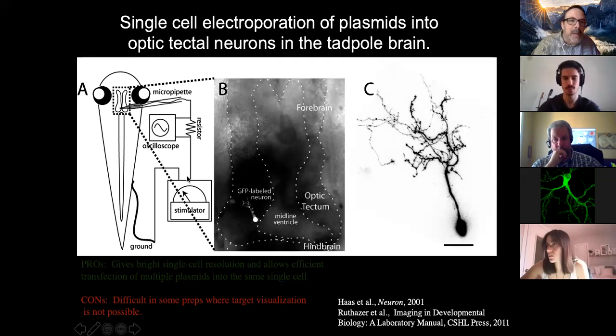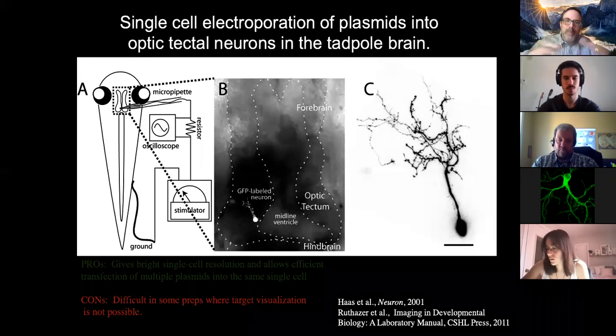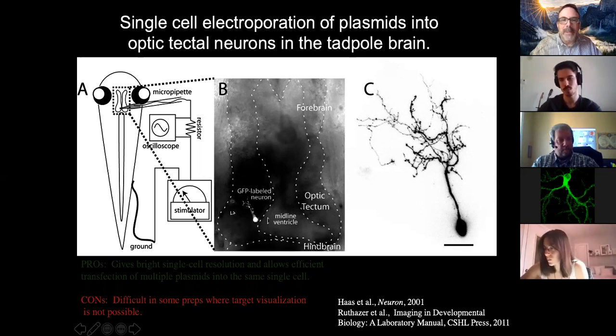In this case, the capacitor is not shown, but we would stick a capacitor in parallel with the stimulator output. That produces this exponential curve, which is quite nice because you disrupt the membrane of the cell with the peak of the curve, and then you continue to force DNA into the cell with the decline. What you end up with roughly 12 to 24 hours later are nice single labeled cells. If you do this improperly, you end up with clusters of cells. But just by changing your positioning or the shape of your pipette, it's very easy to get this optimized. And you have beautiful single cell resolution of Golgi type quality.